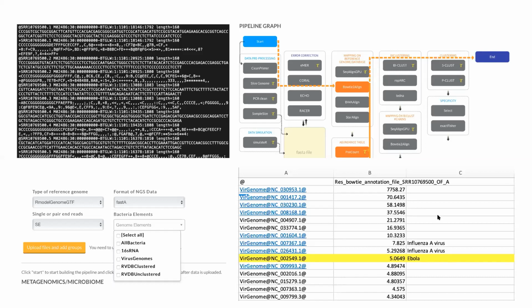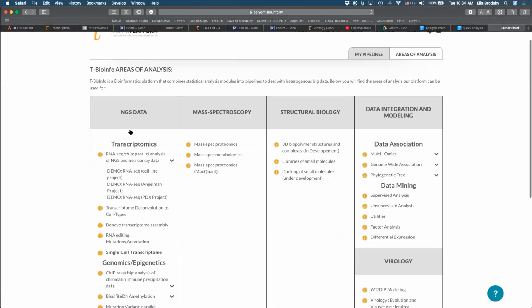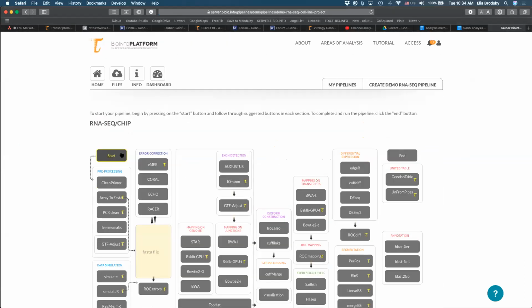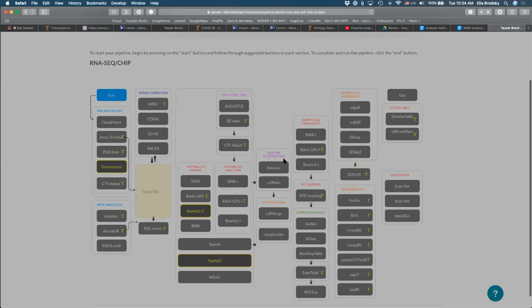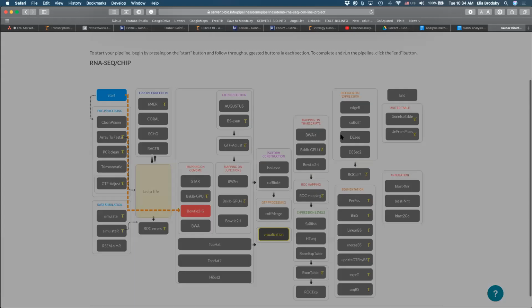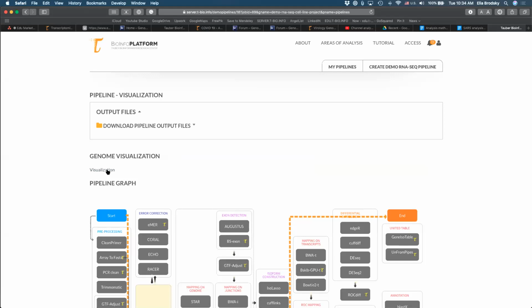So again, you need to, okay, let me do this again. So what we did was this one, right? Suparno, maybe you can follow along. Okay, so I click here, I click on start, bowtie 2G, visualization, end. So I have to click on end, and then I should see a link to visualization. That's how you open the JBrowse page, from this link. Did you find it?